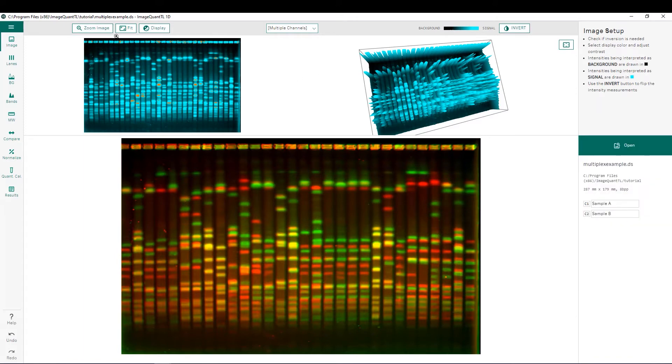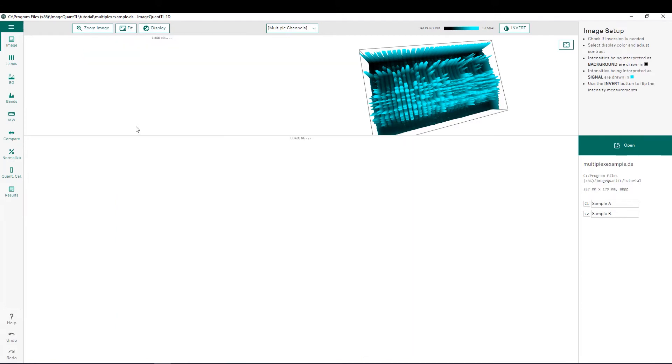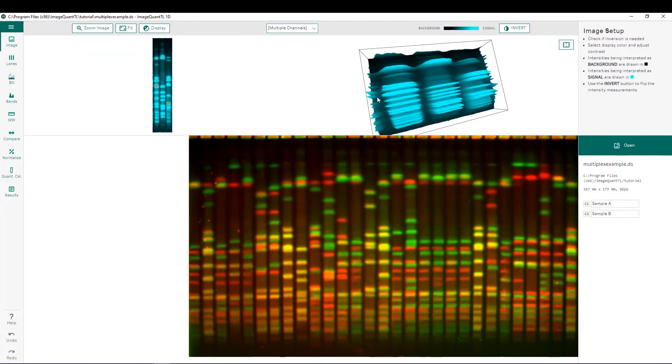We can also choose to zoom our image so if you're interested in a specific lane you can zoom in specifically to that and that image will also be updated in the 3D rendering as well.